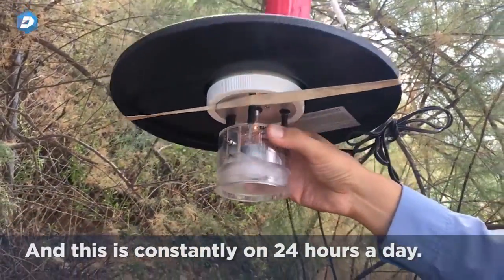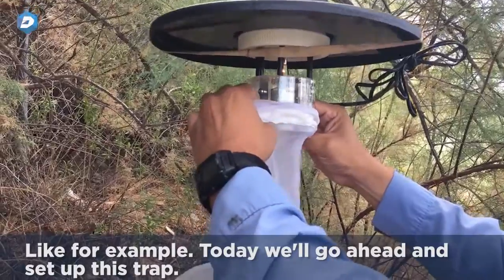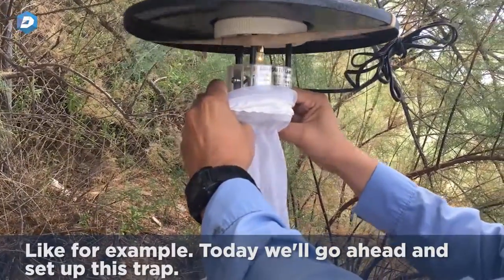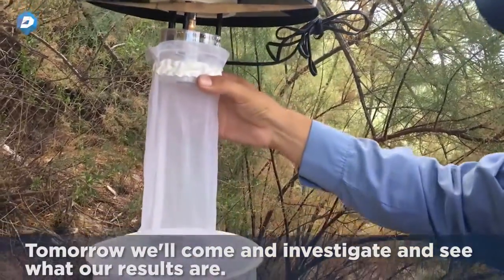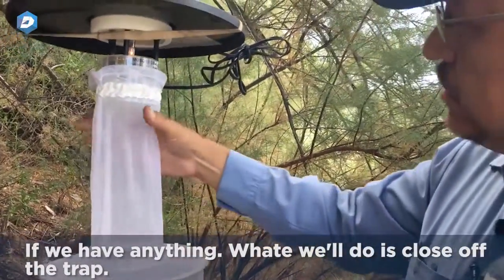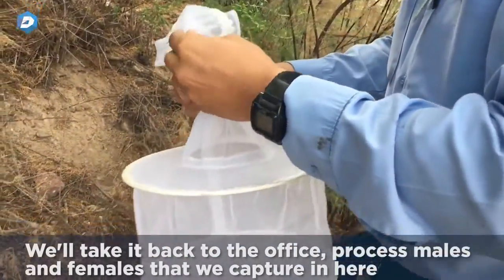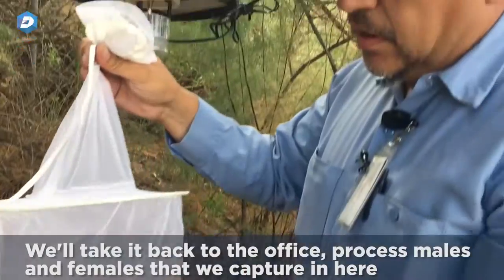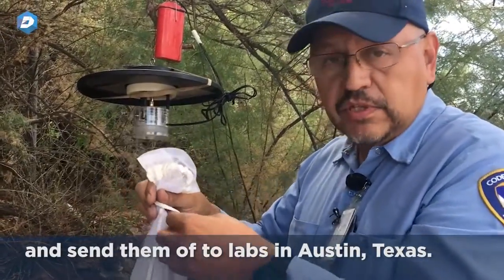I'll show you a quick view of what the fan looks like — this is constantly on 24 hours a day. For example, today we'll go ahead and set up this trap. Tomorrow we'll come and investigate and see what our results are. If we have anything, we'll close off the trap, wrap it up, take it back to the office, process the males and females we captured, and send them off to labs in Austin, Texas.